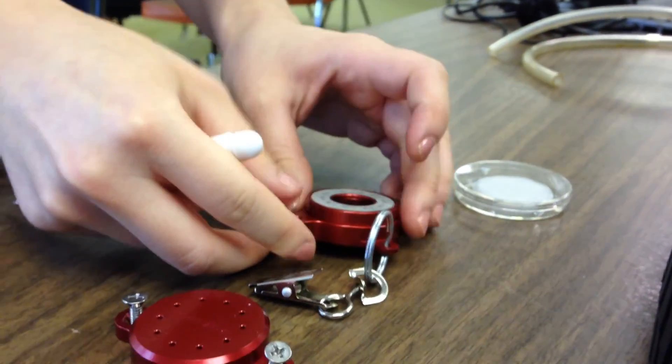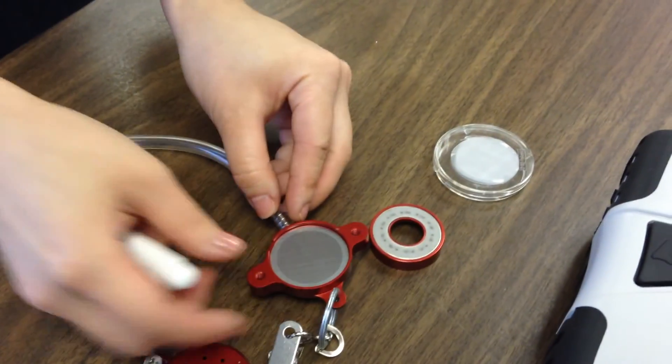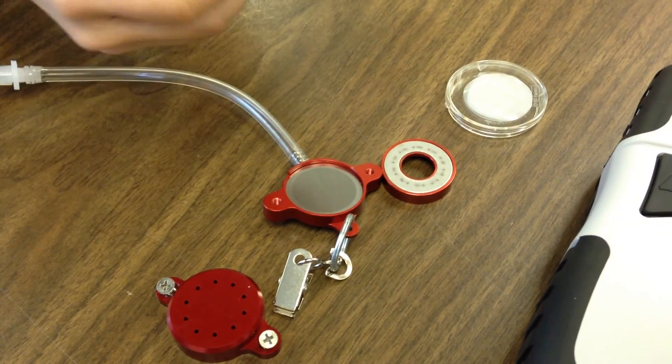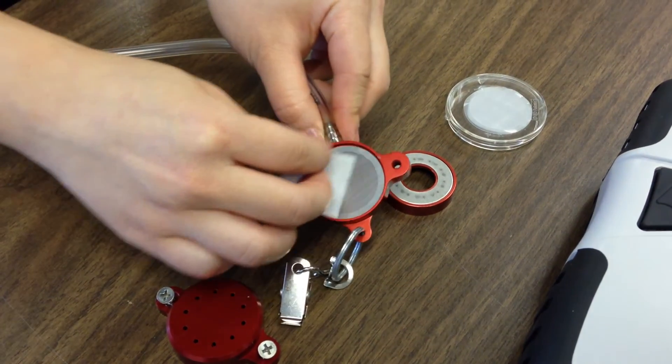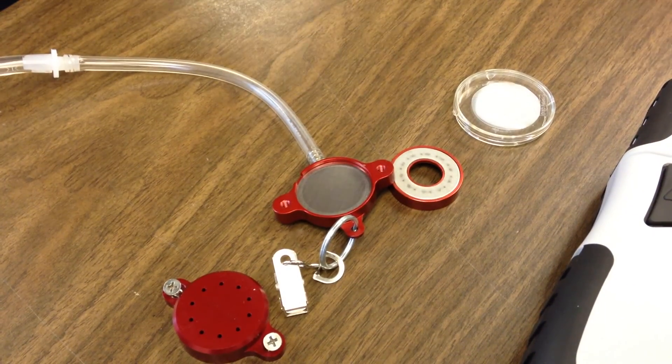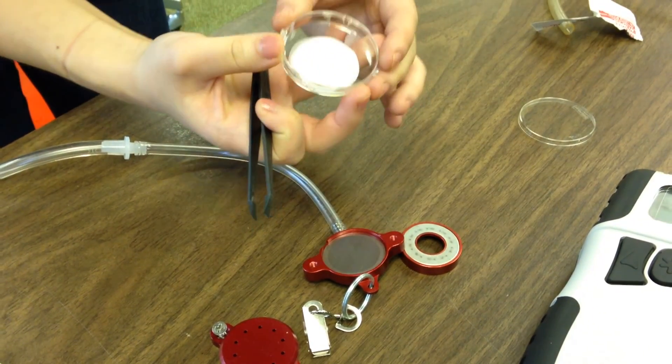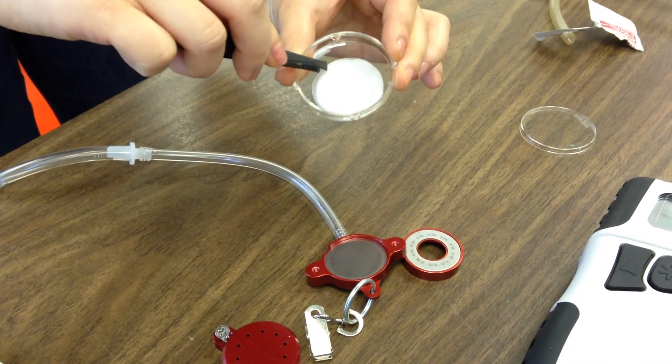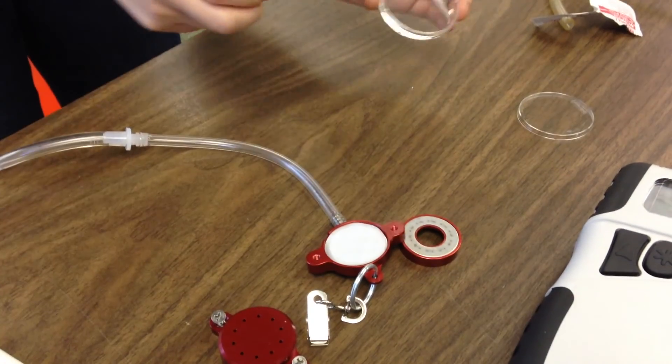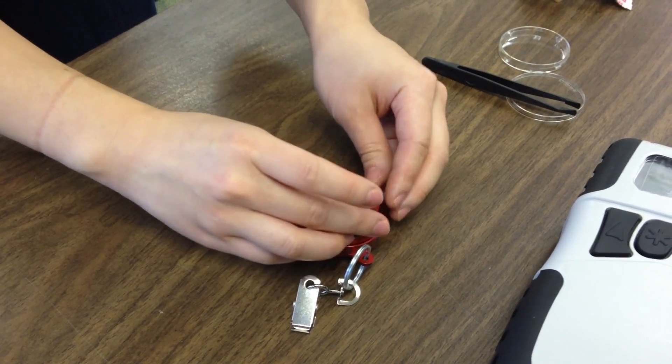Unscrew the cap of the cut point then remove the outer ring. Use an alcohol wipe to clean the stainless steel screen. After letting the screen dry for a few seconds, use tweezers and insert a new Teflon filter. Place the ring back on, then screw the cap back on.